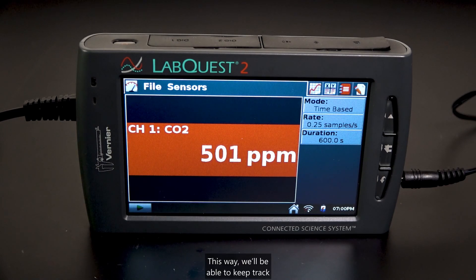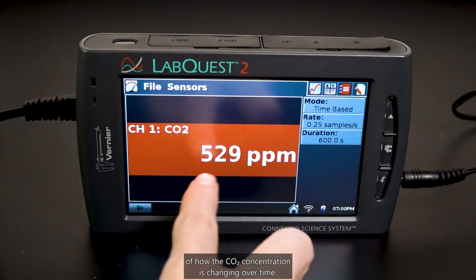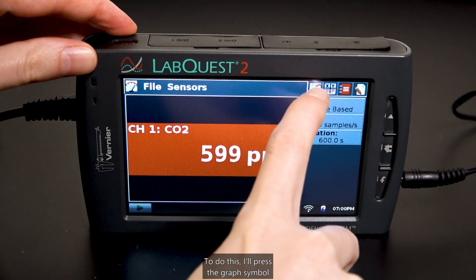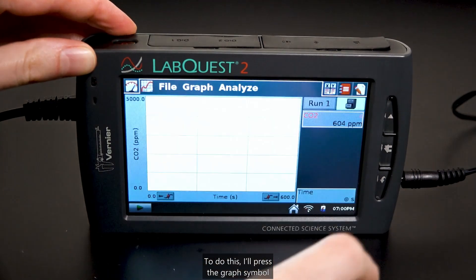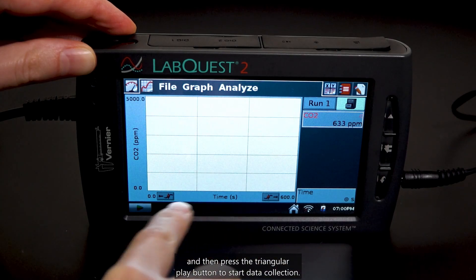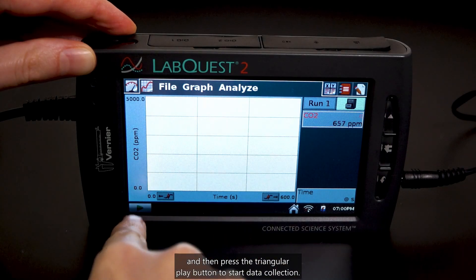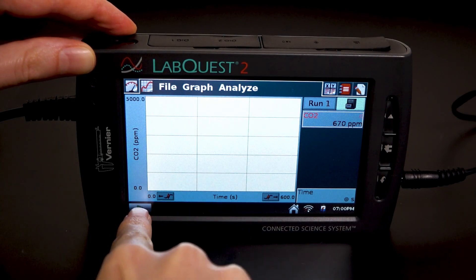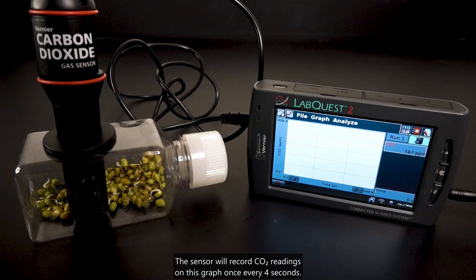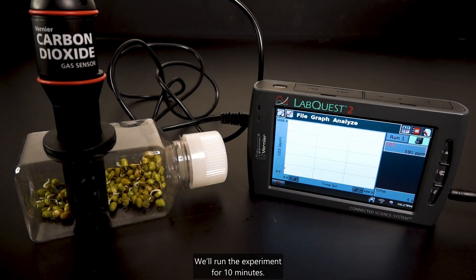But we want to go into experiment mode so that it records readings at regular intervals. This way, we'll be able to keep track of how the CO2 concentration is changing over time. To do this, I'll press the graph symbol and then press the triangular play button to start data collection. The sensor will record CO2 readings on this graph once every 4 seconds. We'll run the experiment for 10 minutes.